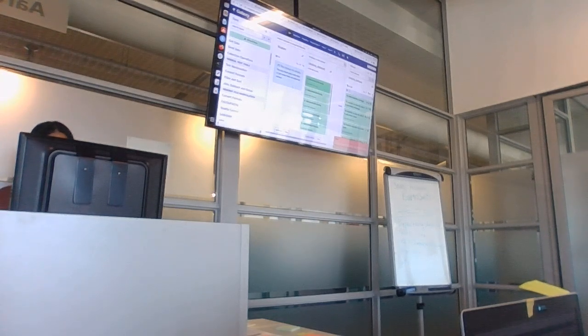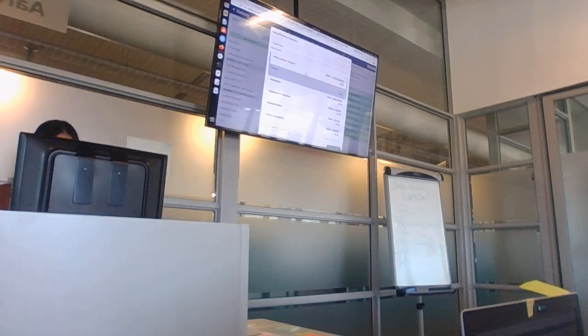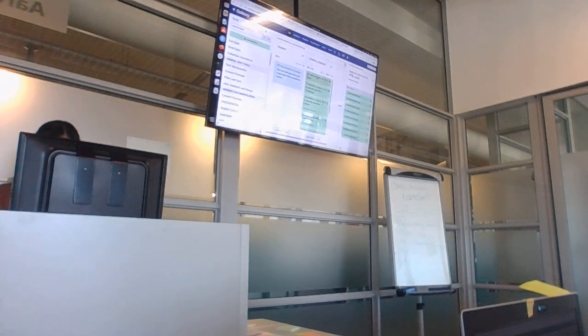You see? Why is this? Is this now the Galaxy Hackathon? No, you need to scroll down. That's a wrong font. I think it's her. No, this is the Colorado. No, but scroll down because that's 6250. Yeah, the 88. You need to go back. History. No. On this. Let me, yeah, choose this again. Yeah, that one. Yeah. Okay. It's still not. Okay, there you go.